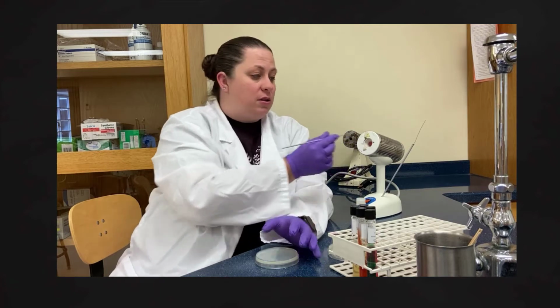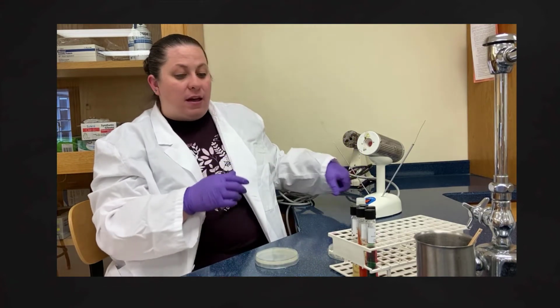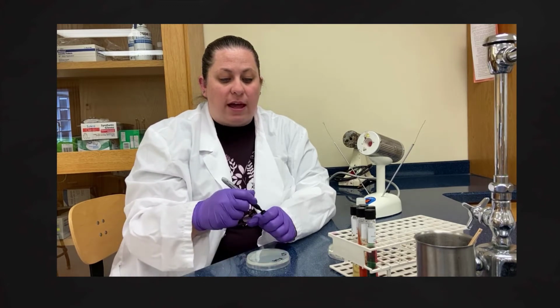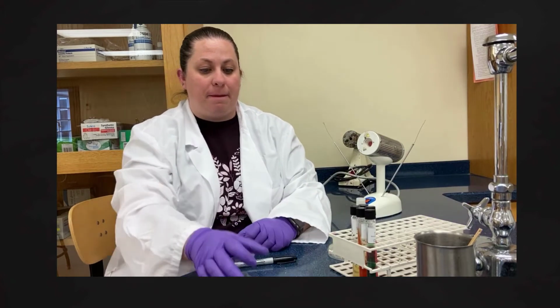And I'm going to have you take a closer look in a minute. I sterilized my needle or my inoculating loop, put it here, but remember, we always have to label our plates. I'm going to put my initial, and I know that in this case, it's E. coli. And put it off to the side.